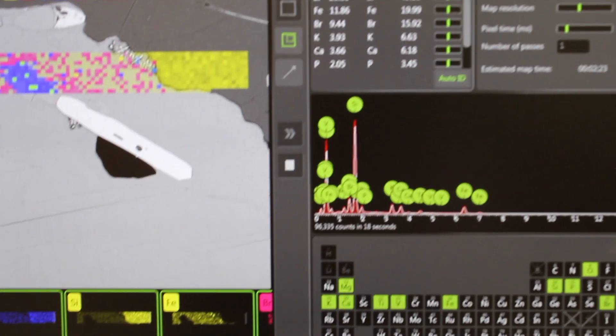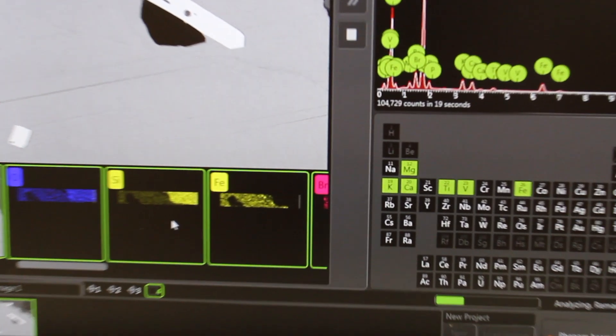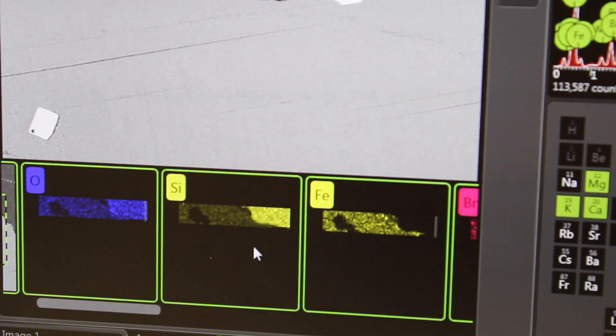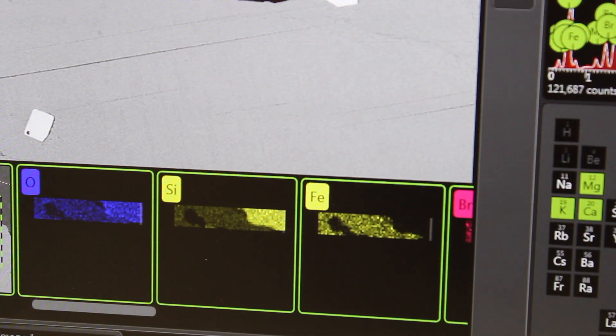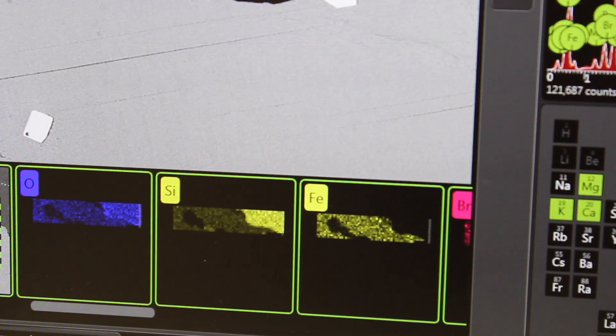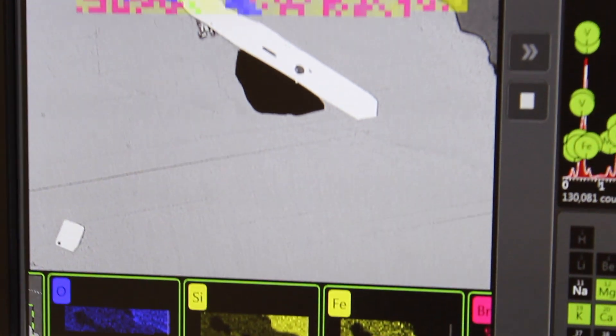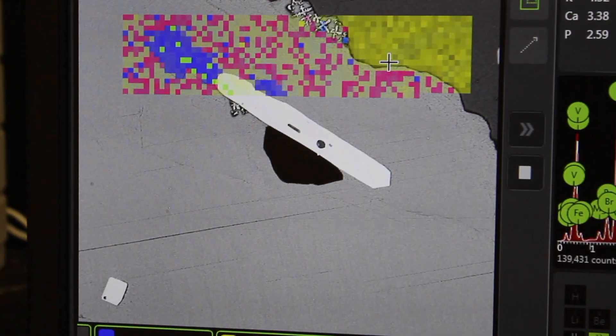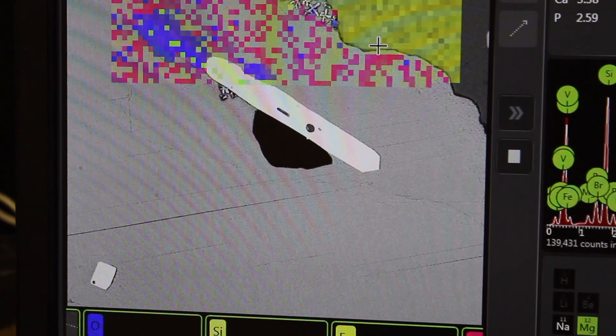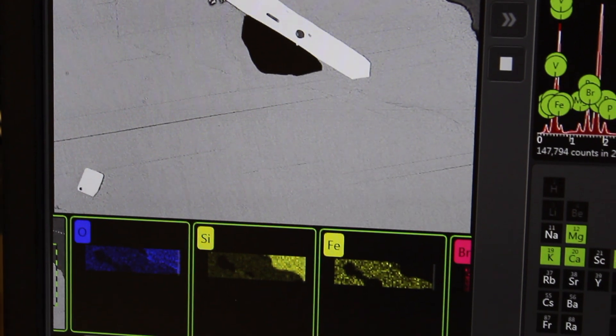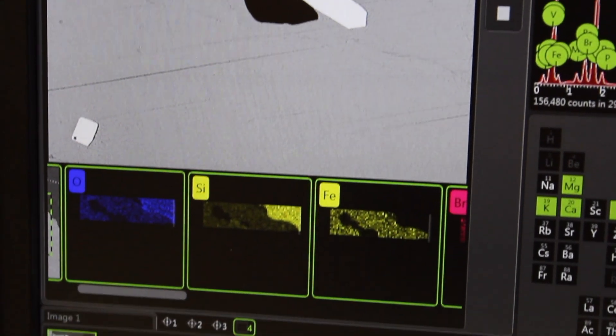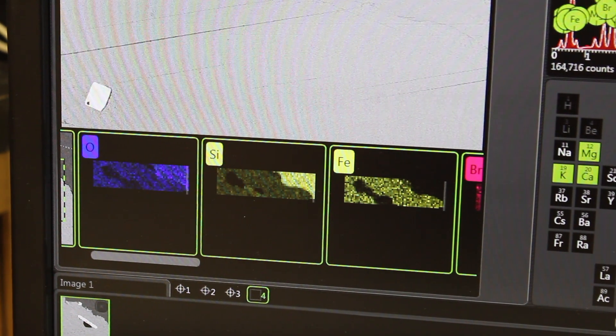So as we're going, you can see what elements it's actually mapping here. There's a composite image at the top, so if you decide you don't want to map certain elements, you can unclick them at the bottom here, and then they won't map it.